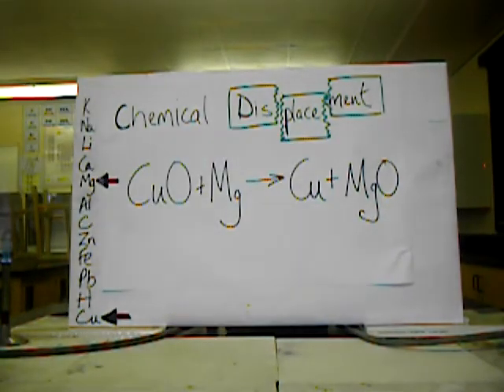This reaction is extremely exothermic, but like many exothermic reactions, it needs a little bit of help to get going, which I will supply using a Bunsen burner.